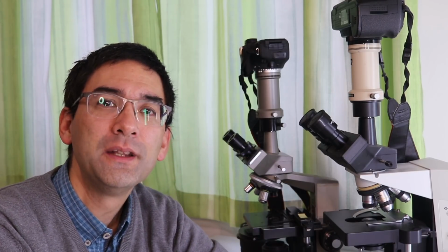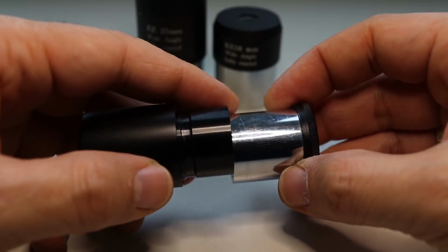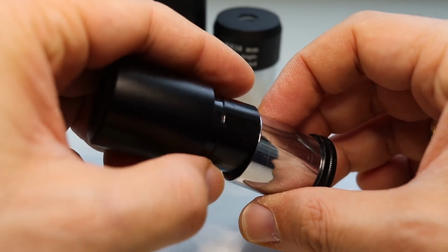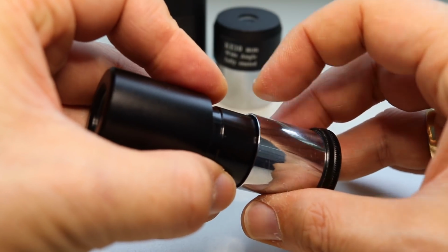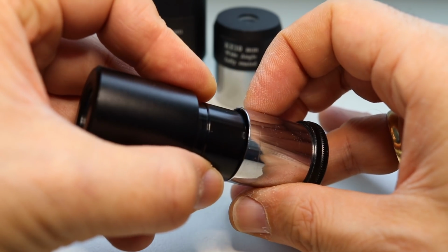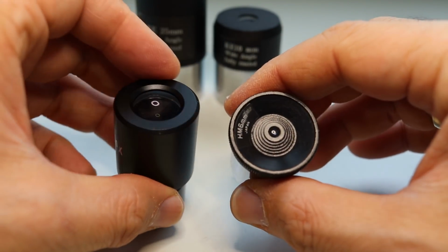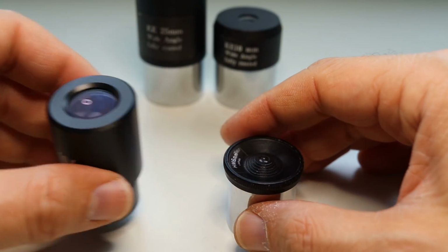Now I'm saying this because there are some telescope eyepieces that have a very similar diameter. It almost looks the same, but it still will not fit because there's a small difference. So as a general rule, exchanging eyepieces between different types of microscopes and with telescopes is actually not going to work. Okay, so now let's have a look at some of the more specific characteristics.